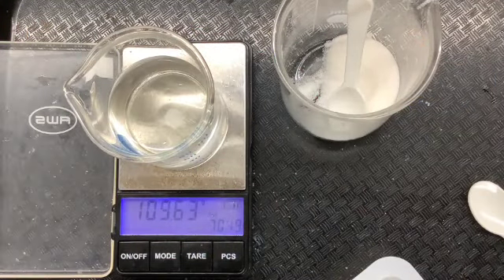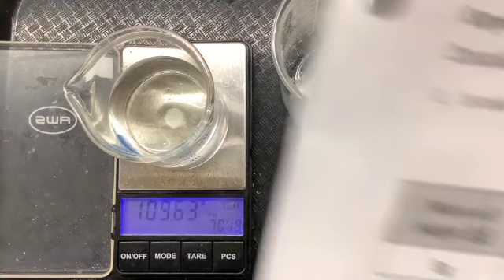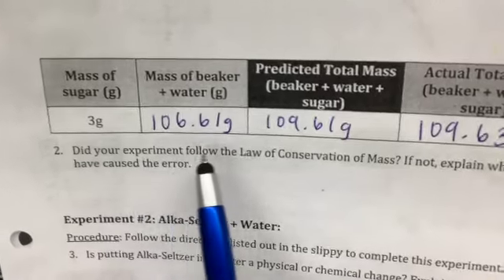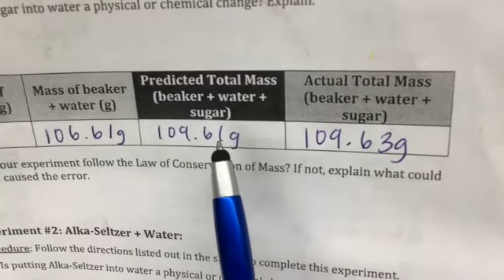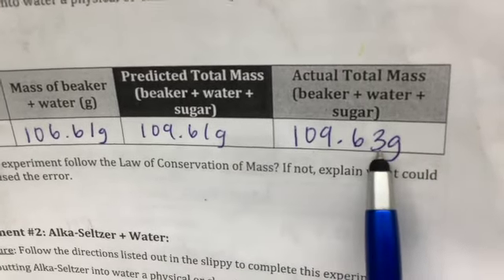That's pretty good. Okay, so our actual total mass of the beaker plus the water plus the sugar is 109.63 grams. Okay, I have it here. So that's pretty close to our predicted total mass. All right, our second question says, did your experiment follow the law of conservation of mass? If not, explain what could have caused the error. Well, I mean, it should have been 0.61, but it was 0.63. That's pretty close.